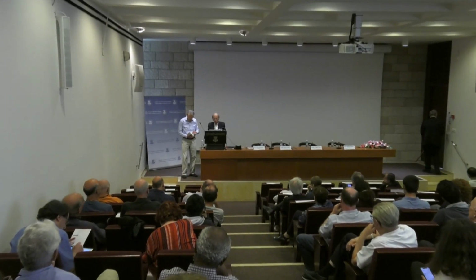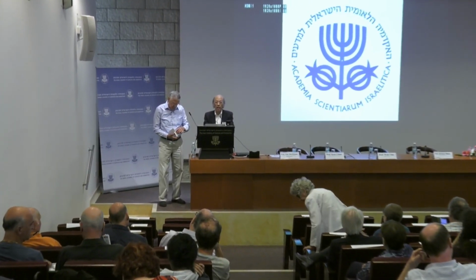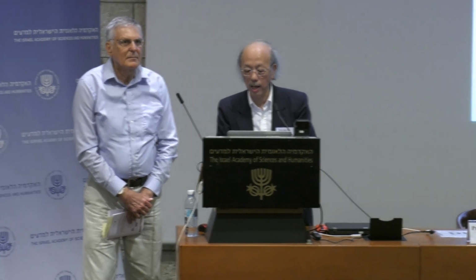And in fact, there are recent studies that in other phages, particularly the double-strand RNA viruses, we have been able to see the double-strand RNA attached to it. So if I may, I can show you one quick slide of that.